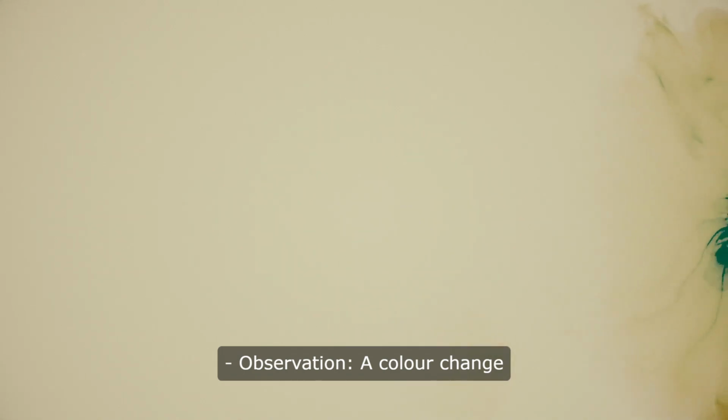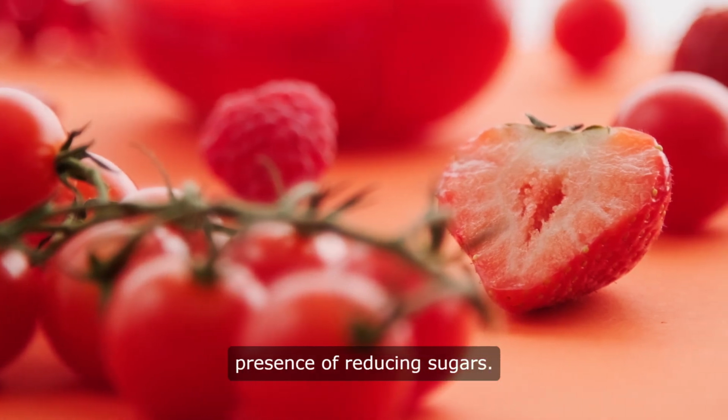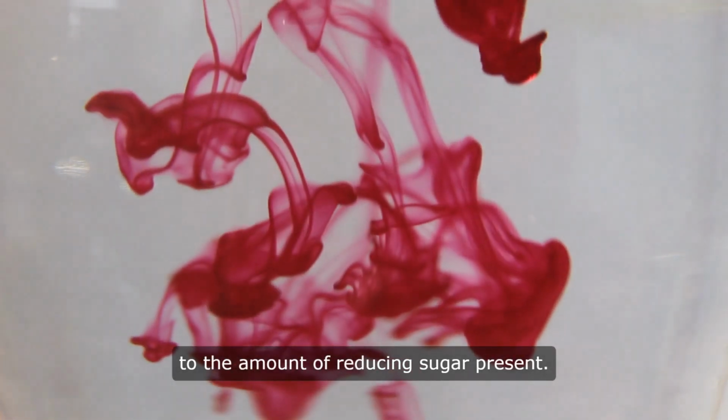Observation. A color change from blue to green, yellow, orange, or red indicates the presence of reducing sugars. The intensity of the color change corresponds to the amount of reducing sugar present.